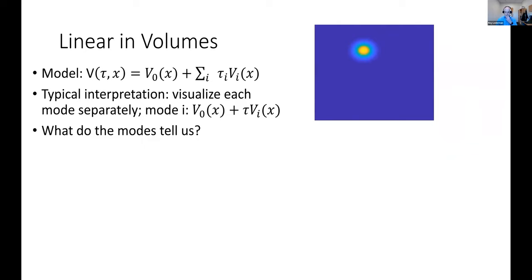So here's a very simple volume, a flat volume, just a two-dimensional thing, and there's something moving around here in a circle. If it were interactive, I would ask you to guess. Maybe Will, you would like to volunteer and guess what the principal volumes look like if you did this typical analysis on this. Since I don't have volunteers, this is the first one.